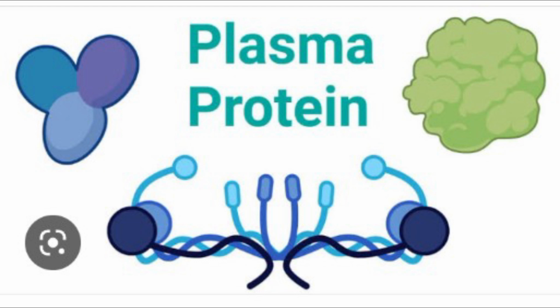Ninhydrin test. The free alpha amino group of protein reacts with ninhydrin and gives a blue color. Sample 1 ml, add 10 drops of ninhydrin, boil it strongly and observe the color. A blue color appears if the solution contains protein with a free alpha amino group.